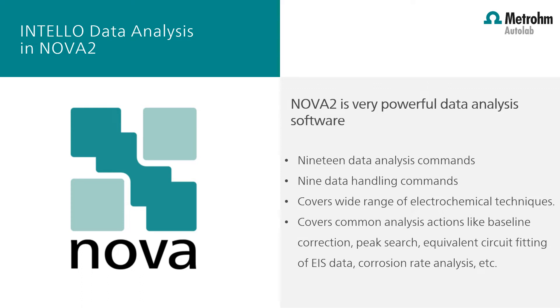Nova offers a comprehensive set of data analysis commands. In fact there are 19 analysis commands and 9 data handling commands in Nova, which can be used to analyze data from a wide range of electrochemical techniques. Nova covers common analysis actions like correcting baseline, searching for peaks, performing equivalent circuit fitting on EIS data, and determining the corrosion rate from linear sweep voltammetry.